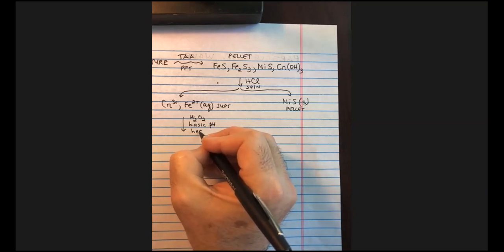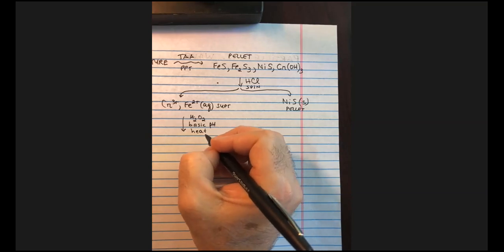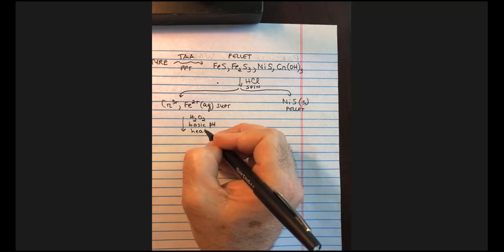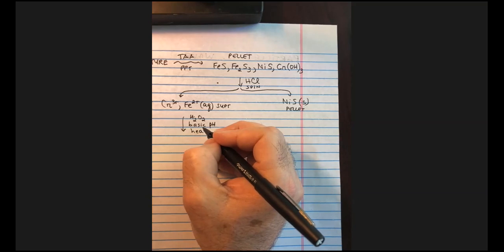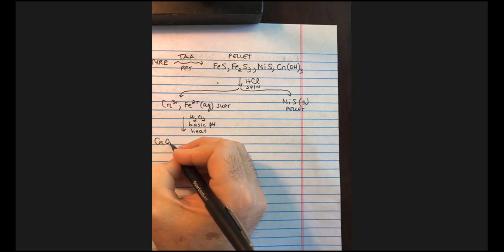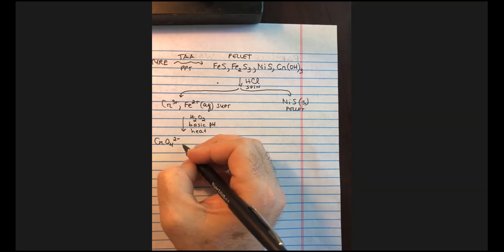And we're going to heat the mixture a little bit. Please read the procedures there, for example, how do I make the pH basic and all that kind of stuff. In a basic pH, and we're going to learn about some of these chemical reactions in our electrochemistry topic in a couple weeks, what happens here is that the chromium ions become chromate ions.